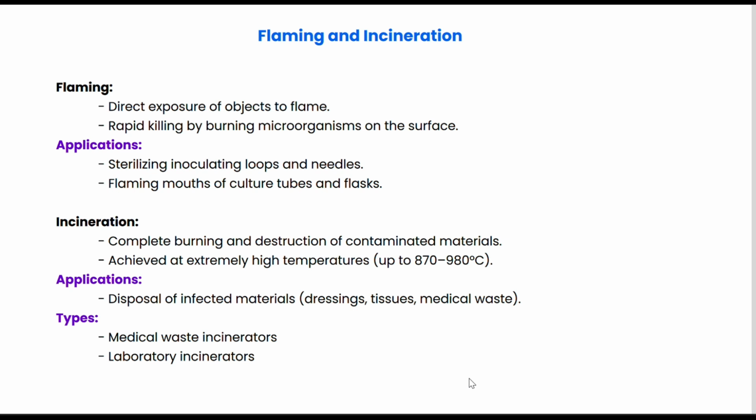This method is widely used for medical waste disposal, such as infected dressings, pathological wastes, animal carcasses, and destruction of disposable contaminated materials like syringes, cotton, and gloves. Specialized medical incinerators and laboratory incinerators are designed to handle different kinds of biological wastes.